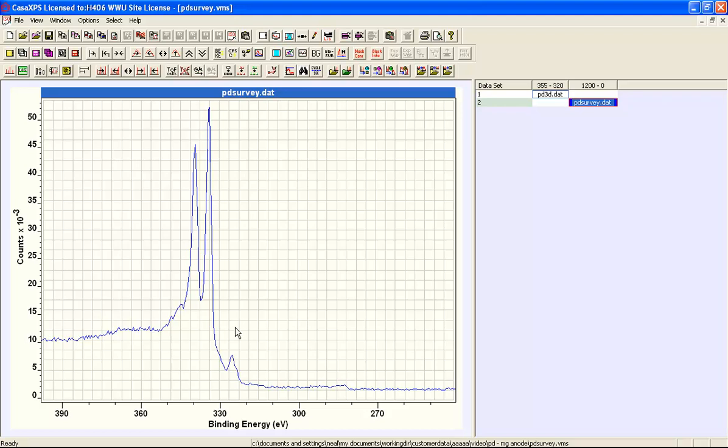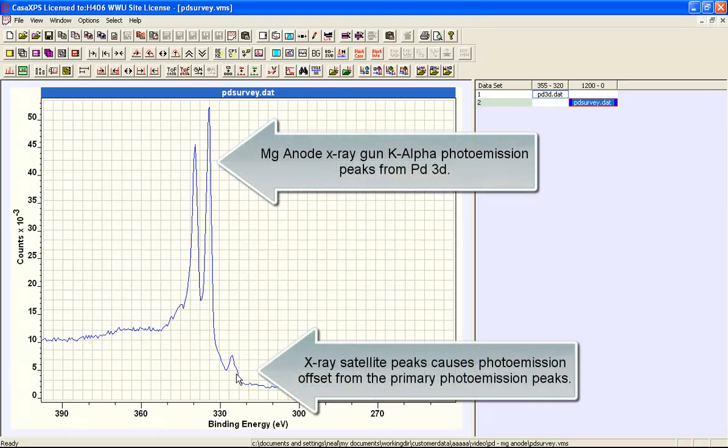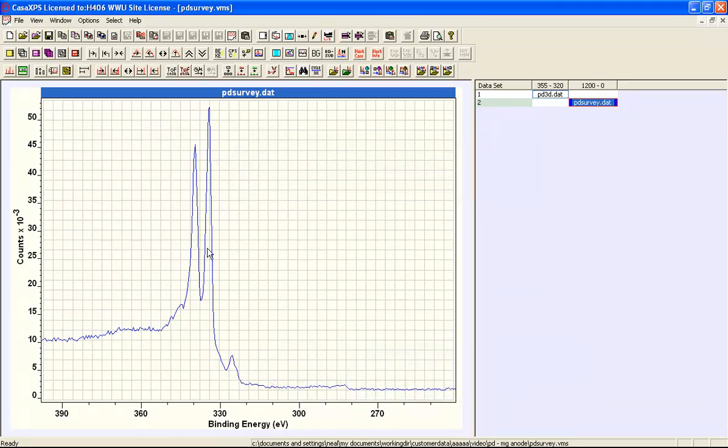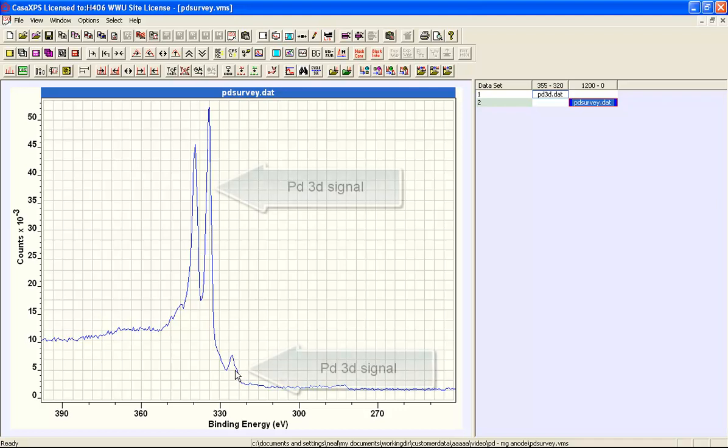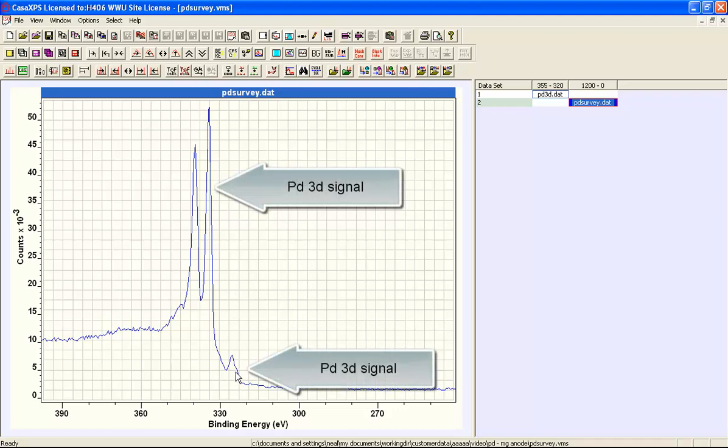Then we have satellite photoemission lines corresponding to different resonances, albeit minor resonances in the magnesium X-ray spectrum. So without the context of the magnesium anode, we may interpret this peak as being something significant in terms of the chemistry of the sample.